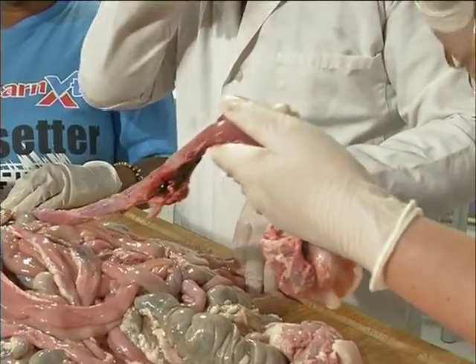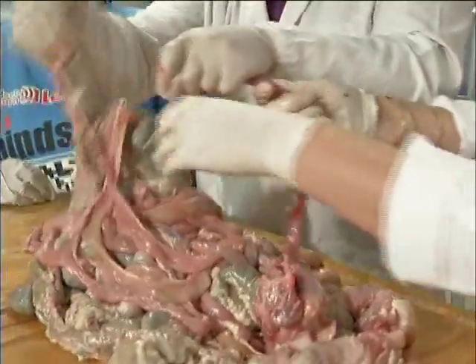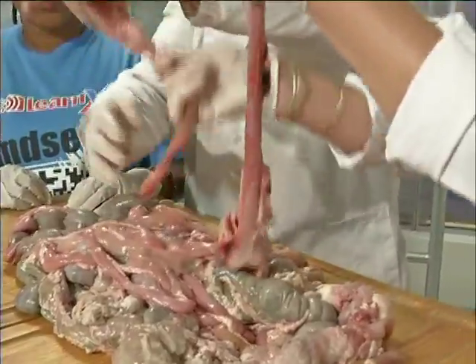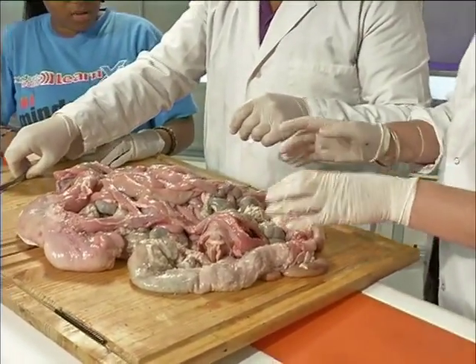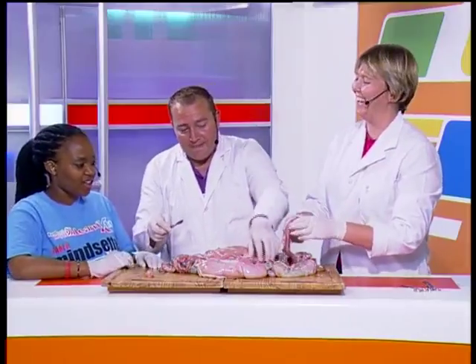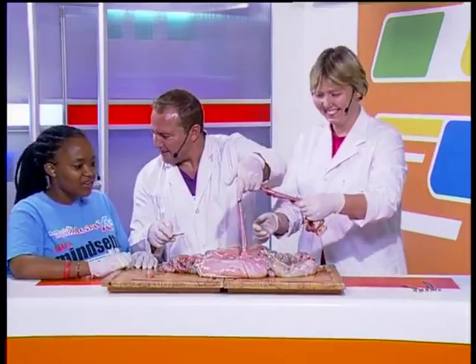Up to the head. It comes from the heart, yes. Very nice. It comes from the heart. And where does it go? It's going to go up to the brain. So it will be either your aorta or your jugular vein. Jugular vein. No, we're telling you. So what do you think it would be? Okay, it's a blood vessel. It's fine.